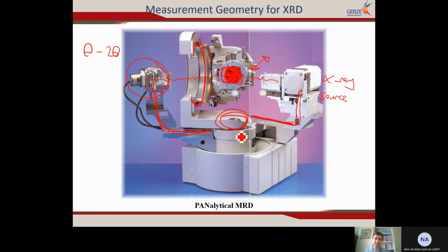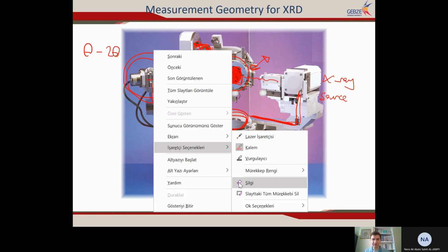You can change many parameters: all these angles, the positions of the axes, let's say the position of the X-ray source, the position of the X-ray detector, the position of the sample, and the position of this stage on this Eulerian cradle. You can change many parameters by using computer programs. There are special programs for X-ray diffraction experiments. With this computer, you can manipulate your experiment, you can start it and leave it, and it can continue by itself. So this is the general X-ray diffractometer system.